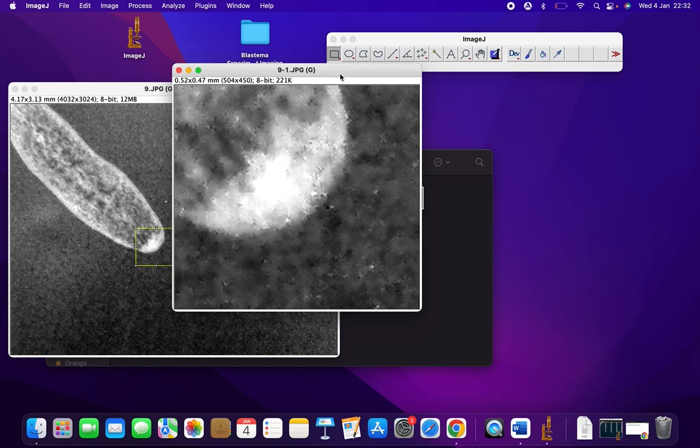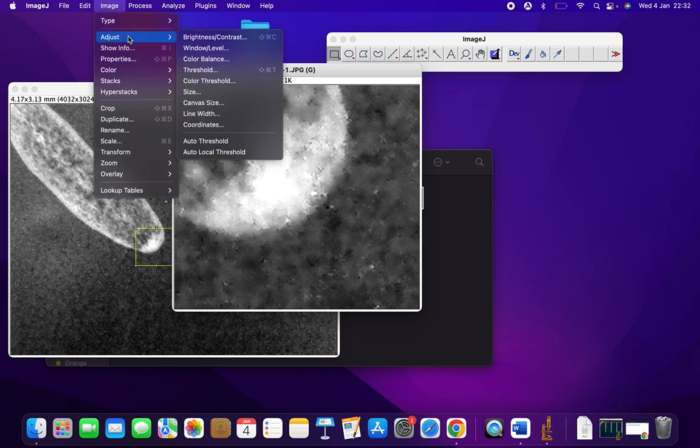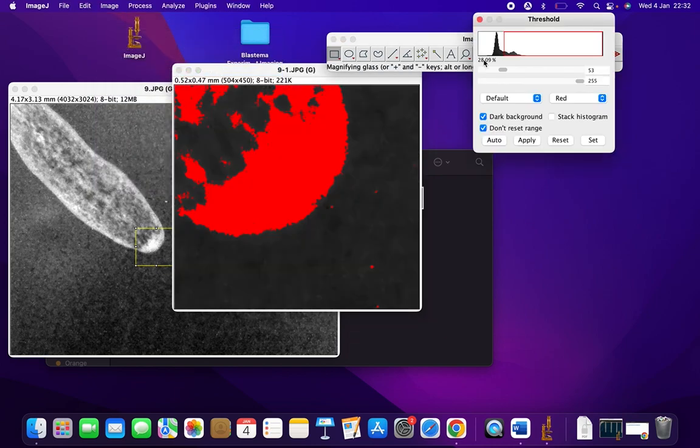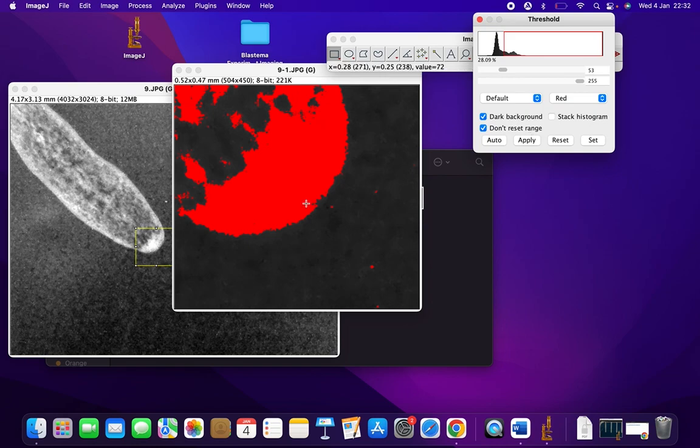We're going to Image > Adjust > Threshold. Ensure that Default and Red are selected when Dark Background and Don't Reset Range are also selected. We want maximum of the blastema to be red in color while the background is black.